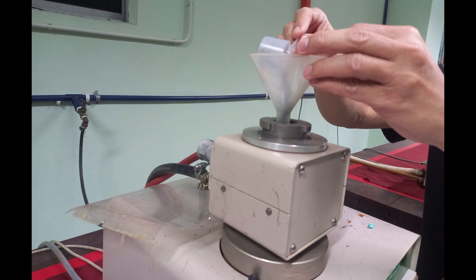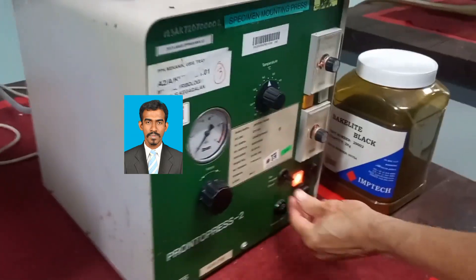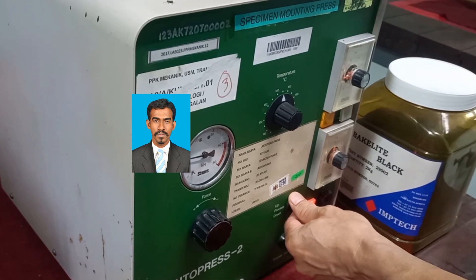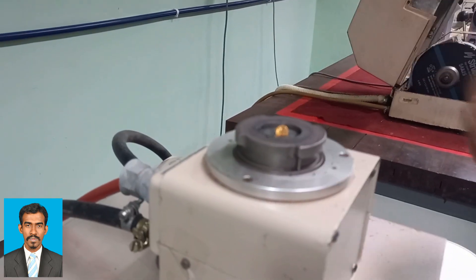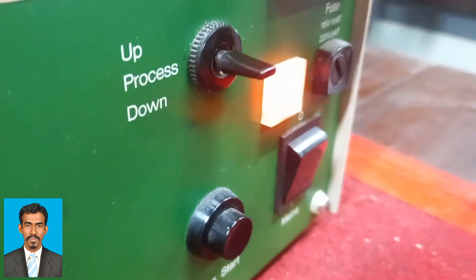Let's get into the experiment. First, switch on and then press the up button in order to move the specimen holder up. Once the specimen holder is moved up, place the specimen on the specimen holder without touching the surface of the press, then lower the specimen holder by pressing the down button.